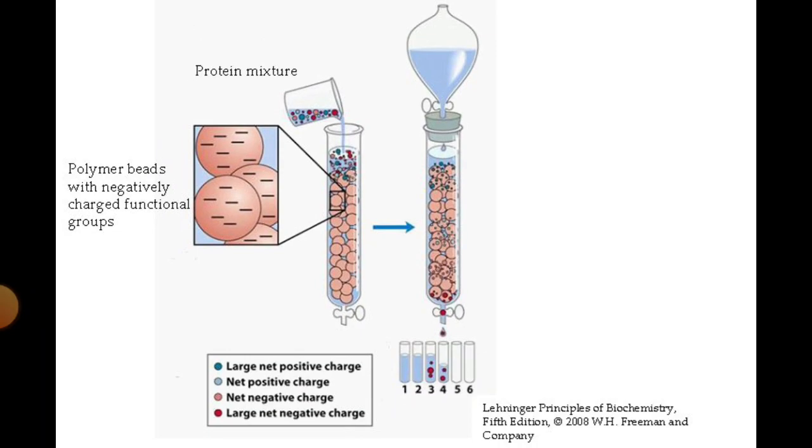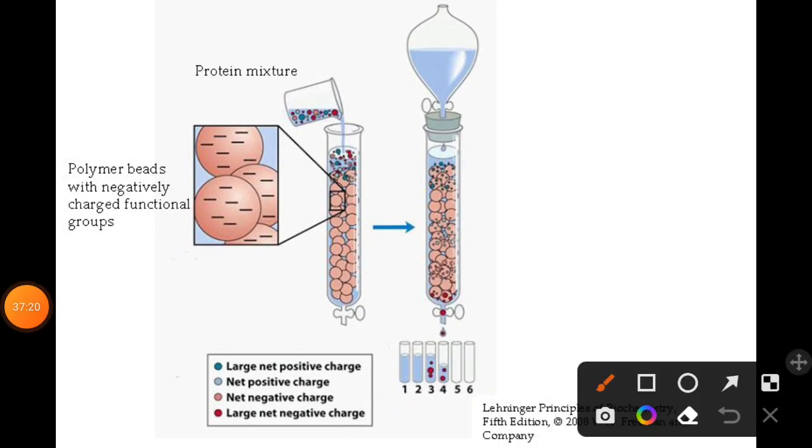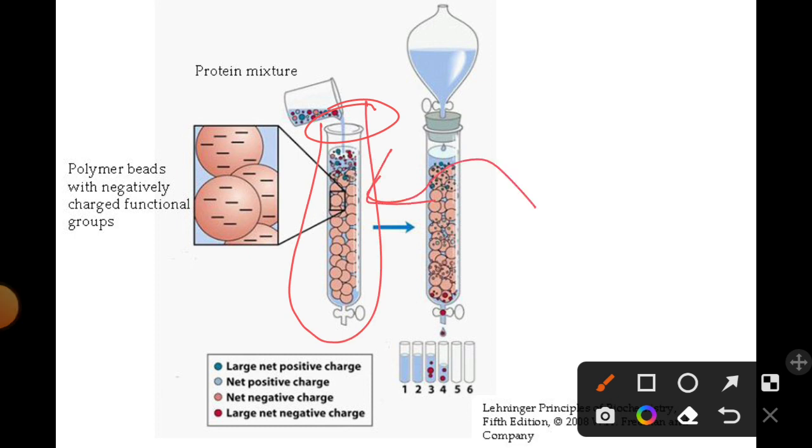So the advantages of ion exchange chromatography are that it has a longer resin life, cheap maintenance, and we are dealing with environmentally friendly compounds. And the disadvantages are the nature of the exchanging ions and the nature and properties of the ion exchange resin.